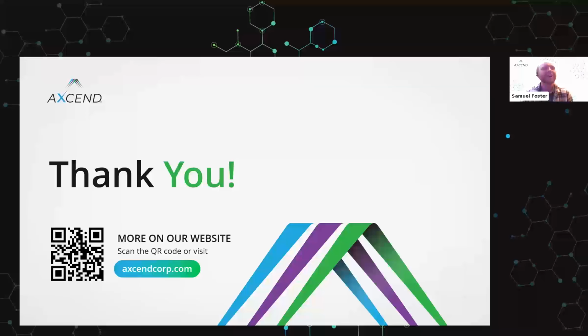We have another one. If someone wanted to convert an existing LCMS method to low flow, what are the biggest challenges they should expect? I think the biggest challenge is, and we've been talking about converting methods all throughout this series, it's primarily going to be making sure that you have the right source. As I talked about, you have to shrink the inner diameter of your ESI source to account for the reduced flow. And so if you don't reduce that source and you're using an analytical scale source with capillary scale flow rates, you're not going to see much of anything and it's going to be very poor.